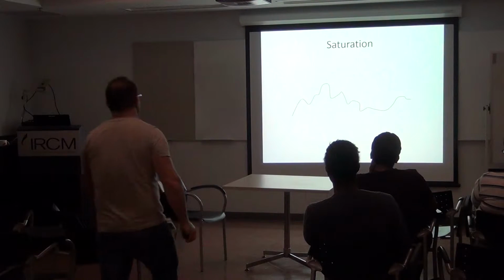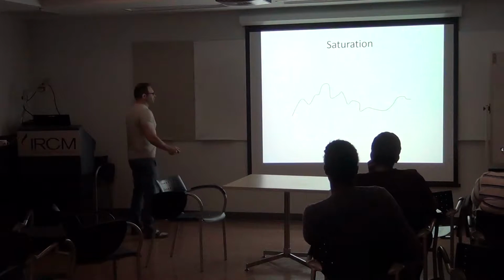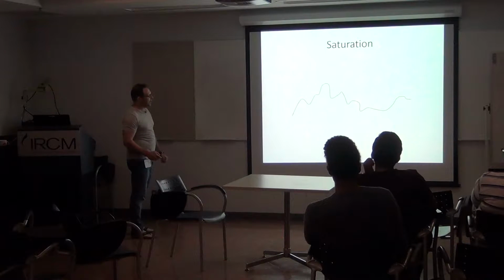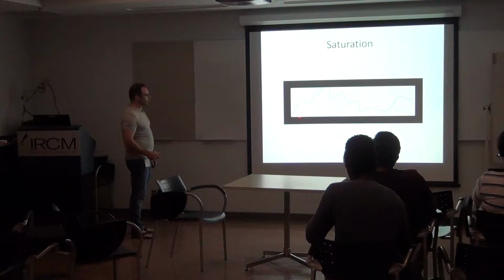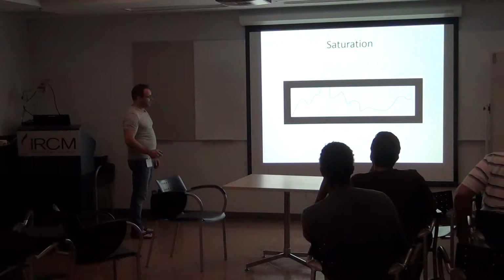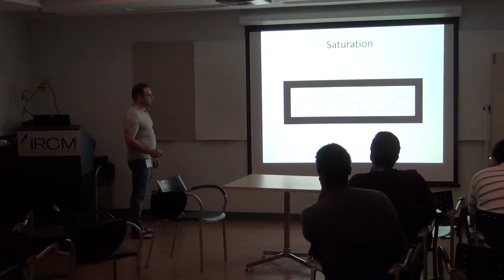Okay, saturation. Let's say you have a signal, and then you take a look at it. But if you're only able to measure at maximum this, then the signal gets over it, but you don't see it.